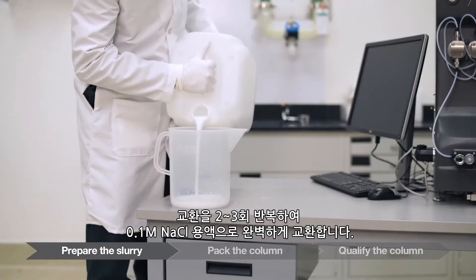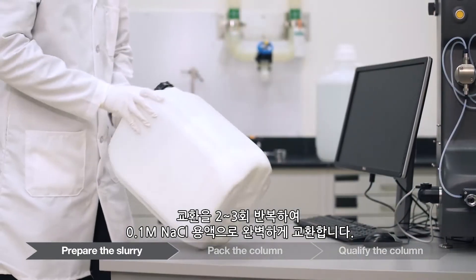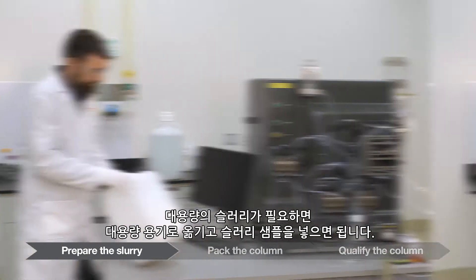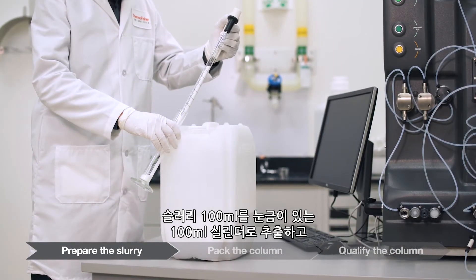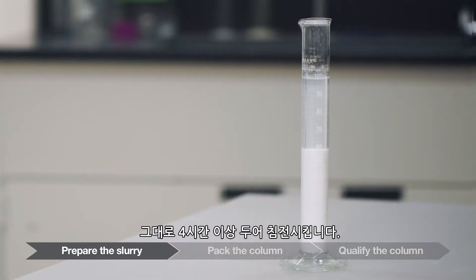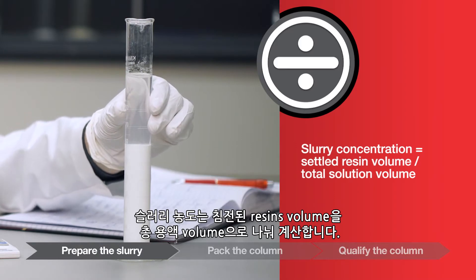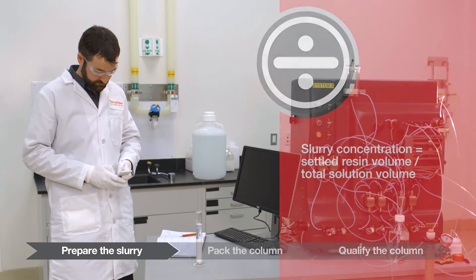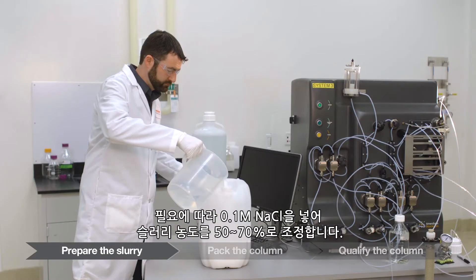Repeat the exchange two to three times to thoroughly exchange into the 0.1 molar sodium chloride packing solution. If a larger volume of slurry is needed, pool into a larger vessel and take a slurry sample. Verify that the slurry ratio is 50 to 70% by sampling 100 milliliters of slurry in a 100 milliliter graduated cylinder and gravity settling for greater than four hours. The slurry concentration is calculated as the settled resin volume divided by the total solution volume. Adjust the slurry concentration to 50 to 70% with 0.1 molar sodium chloride if needed.